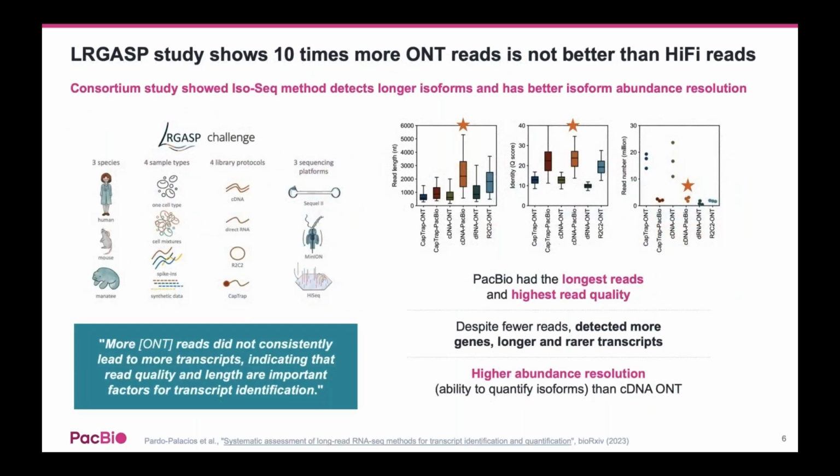Recently, the Long-Read RNA-Seq Genome Annotation Assessment Project, or LR-GASP, consortium published a preprint on the comparison of different cDNA preparations and long-read sequencing platforms for RNA sequencing.